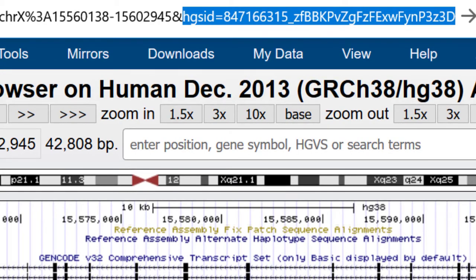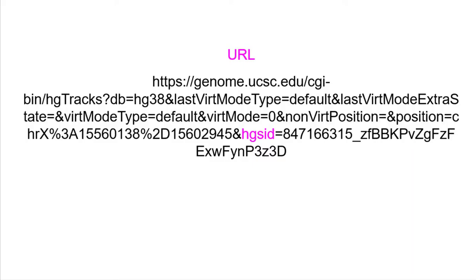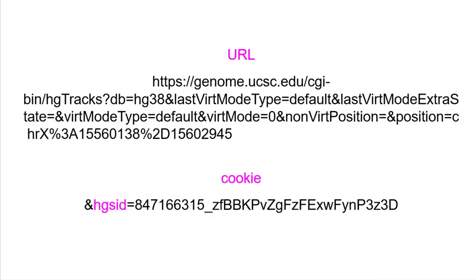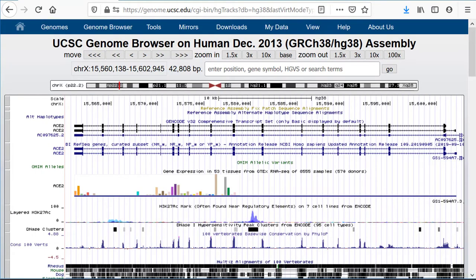If you send someone a link with the HGS ID session identifier cookie in it, the link will continue to follow you around, resetting every time you do anything on the browser. When a link with an HGS ID is clicked at a later time, your most recent view in the browser will show up, not the place you think you saved and shared.